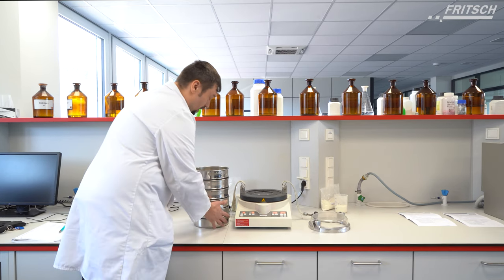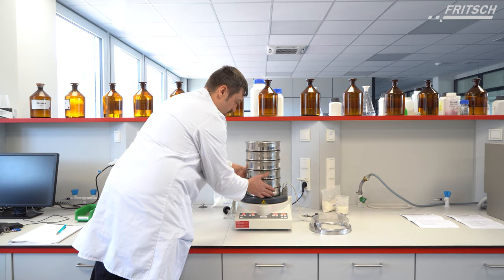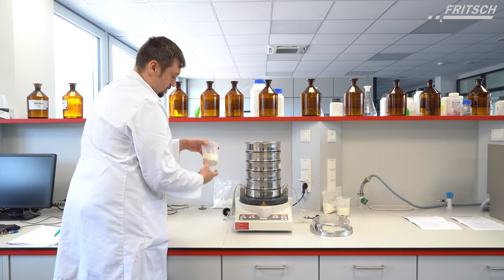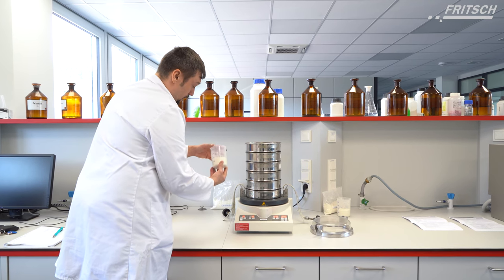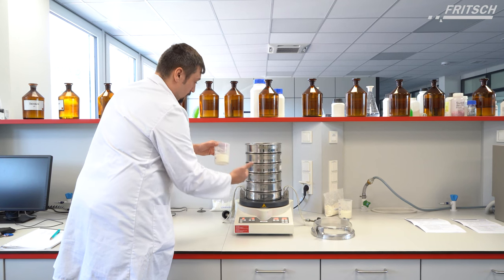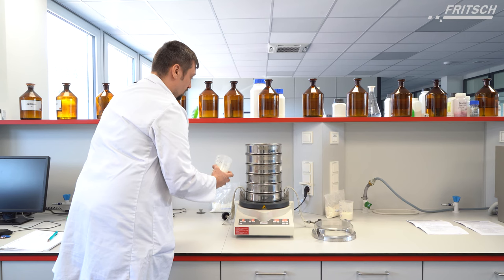Now we can put the whole sieve stack on the NLZ3, and we can put the sample of 100 grams — this is the green flour sample — on top of the top sieve.